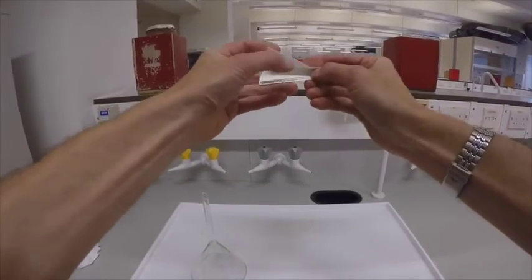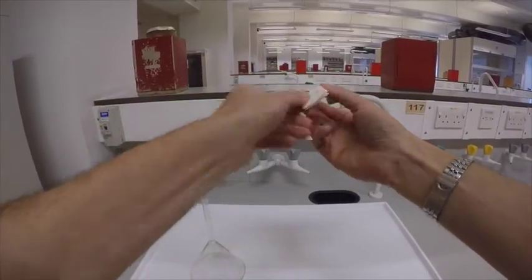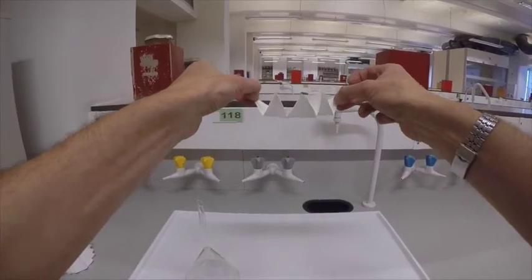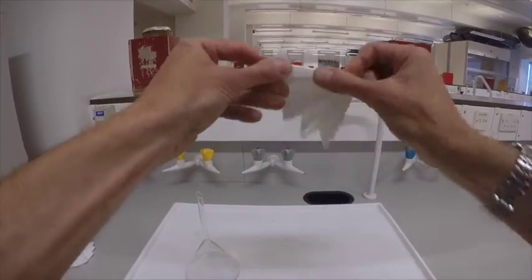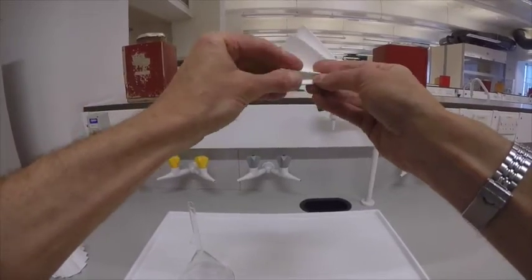We can always check whether we're doing this right by opening it up and seeing that we have a double W — in other words, a zigzag. Let's do it once more: we flick it back and forth like so.